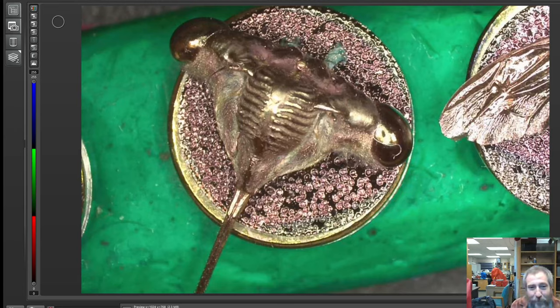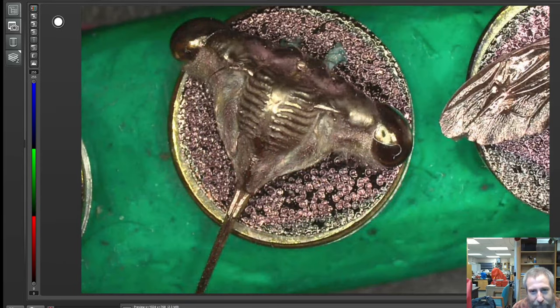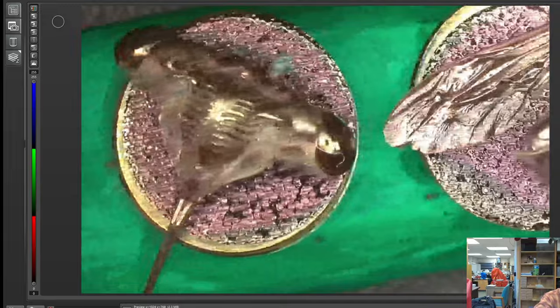It does look a little bit like a horseshoe crab. It's just the head, though. I decapitated a cicada, and then we stuck it in, it was dead already. Look at its body over here, too. It had ants crawling through it, you know, it was gone. But I cut off the head plate, basically, and then we just put that on there, so it's like its little proboscis, mouth parts, and the grill on the front of the cicada there, and then its two eyes on the sides, so they're compound eyes, and we can actually do a bit of zooming in on some of this stuff.